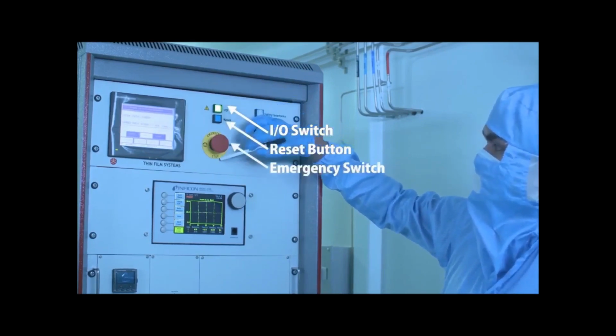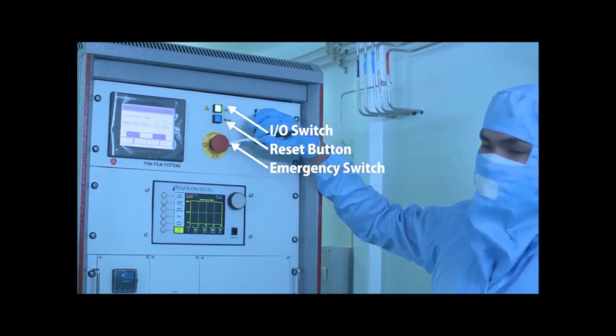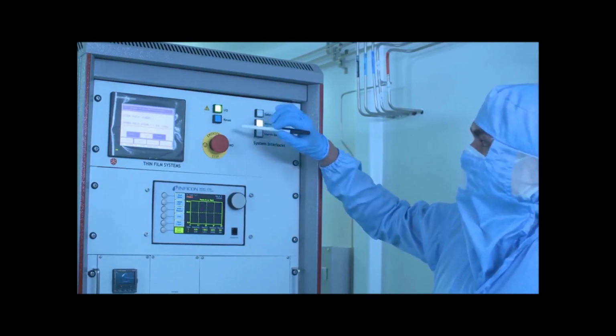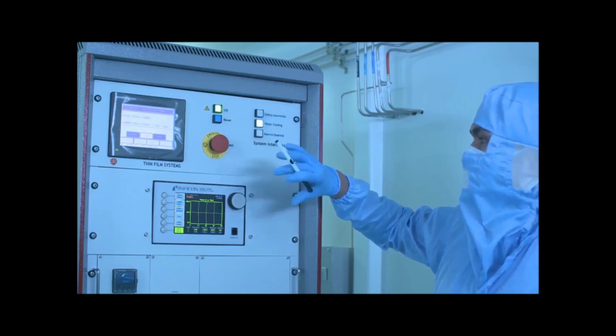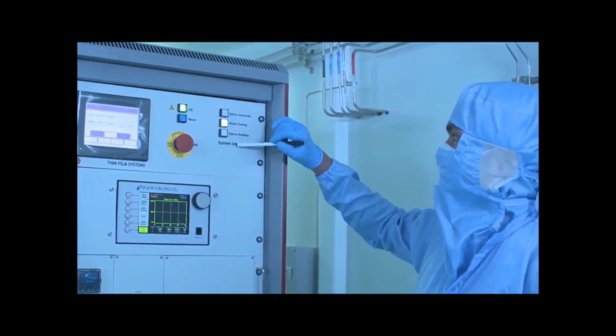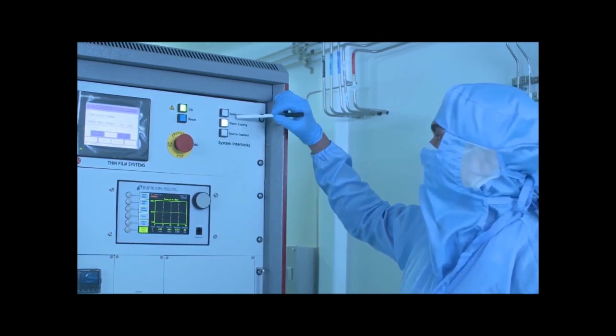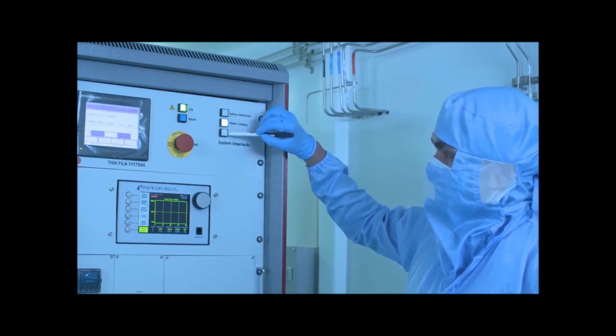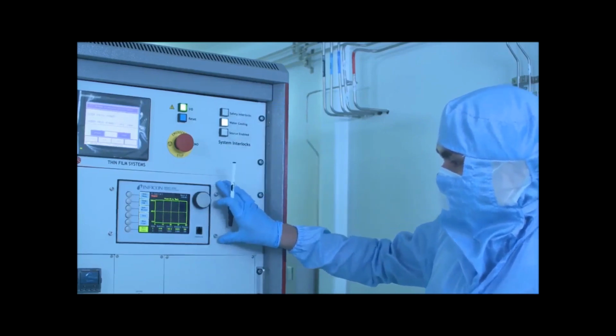and this is the emergency stop button. So if there is any mishap during the deposition, we can directly push this emergency stop and can stop all the process at one time. And this shows the status of the safety interlocks and water cooling system, and when the source is enabled, it will glow. Next is the most important part of our control unit.